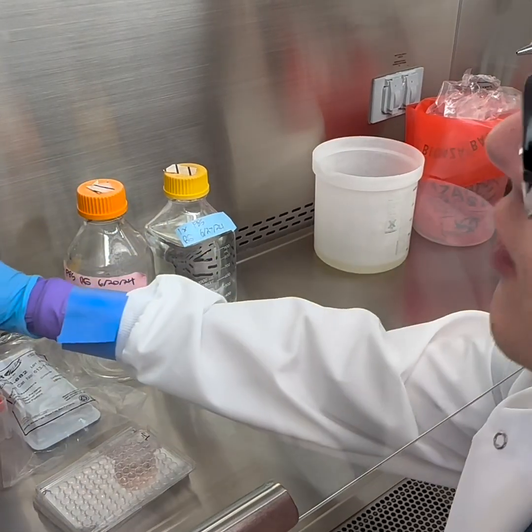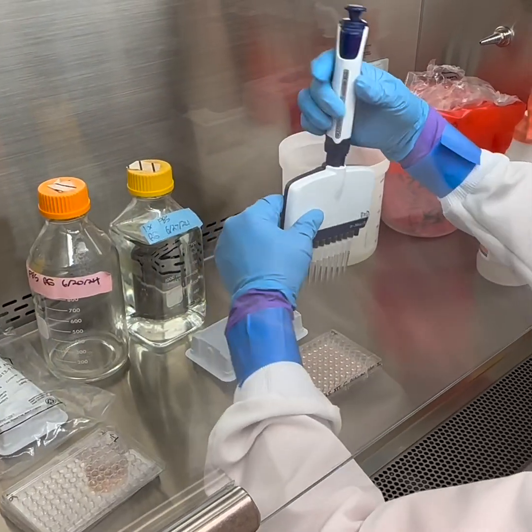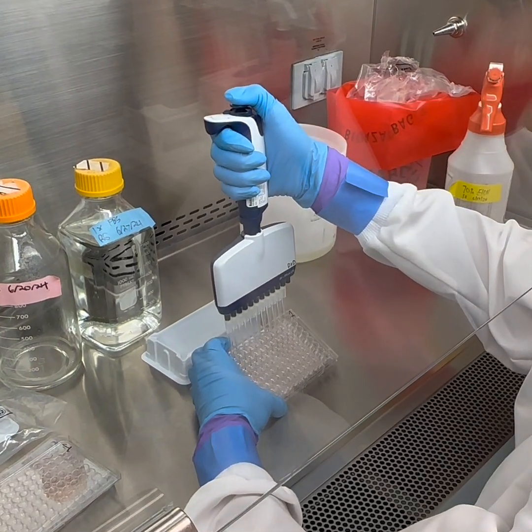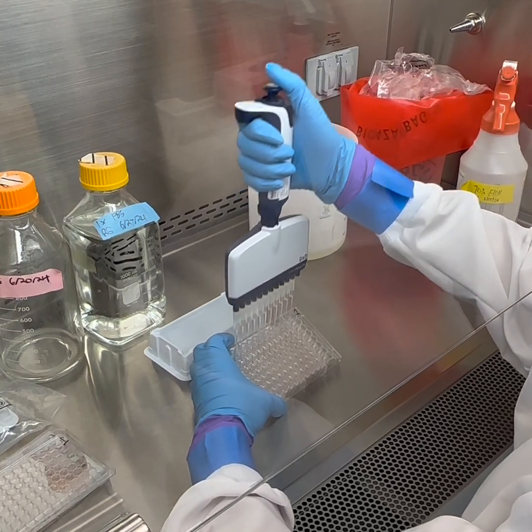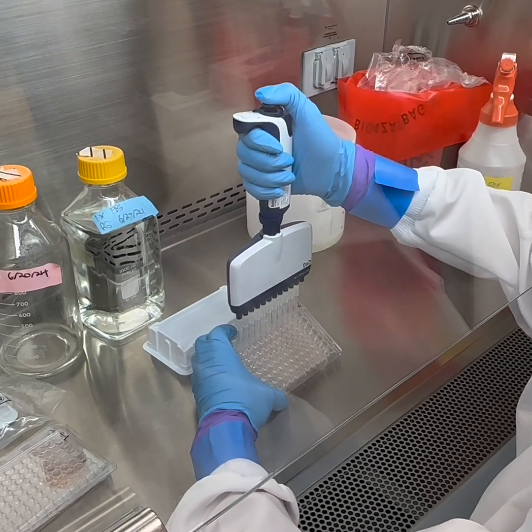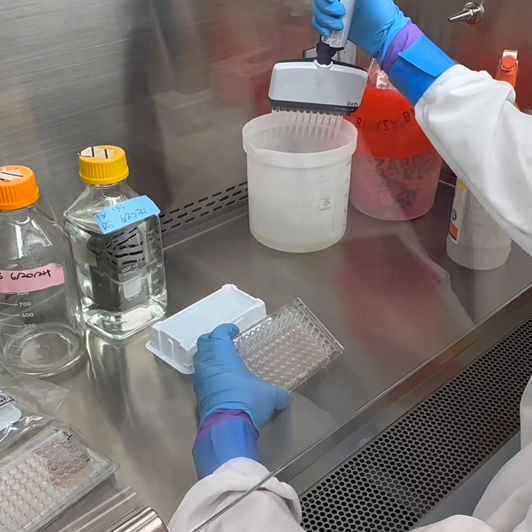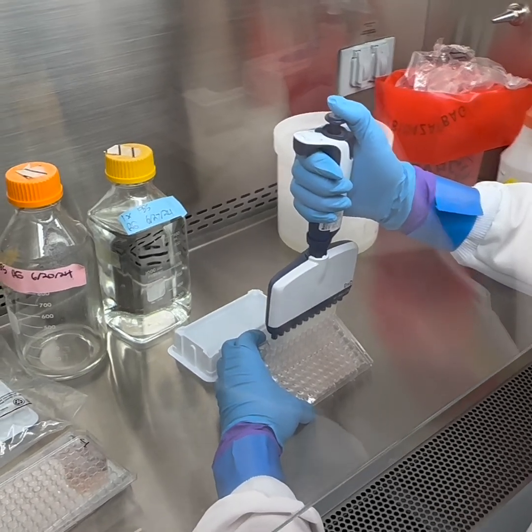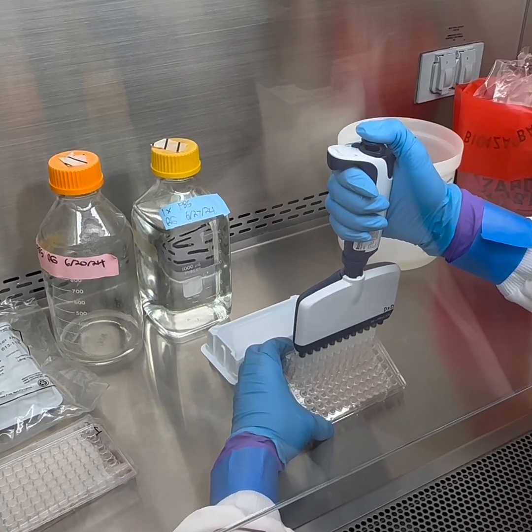But I'm just going to remove about 100 microliters to wash. So you can do 3 times, or in this case we're just going to be doing 1 time because we're doing enhanced BSL-2 precautions, and we found it's going to take a pretty crazy amount of time if you're aspirating with the pipette instead of tapping it out like you would in a regular assay.